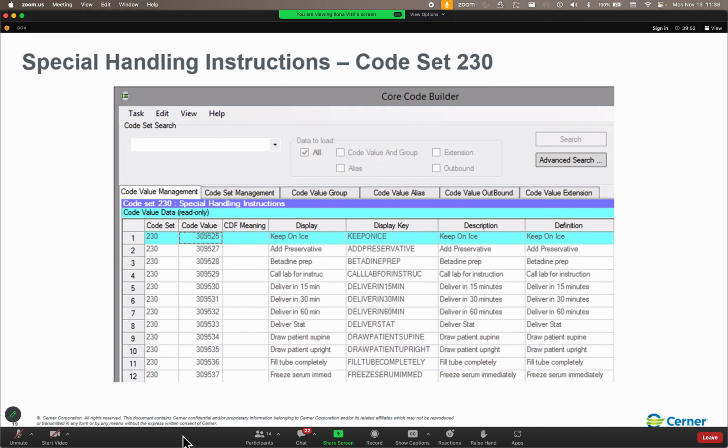Well, let's make it easier. 1 a.m. tomorrow morning. So Tuesday morning, 1 a.m., AM draw collection priority. What is the default start time going to be? Nope. It'll be Wednesday morning at 3:30.